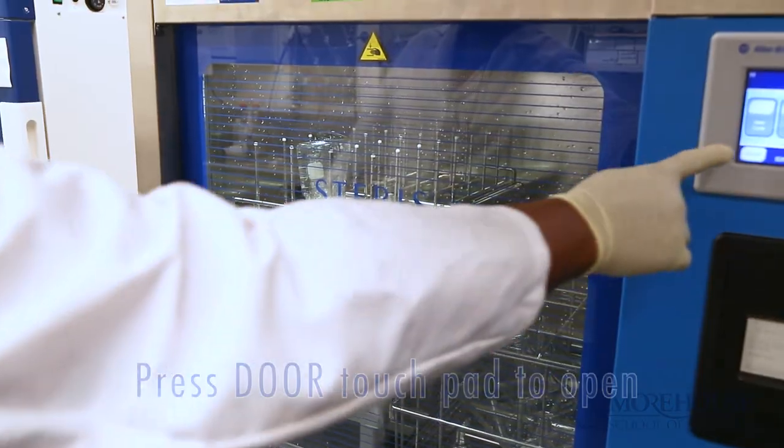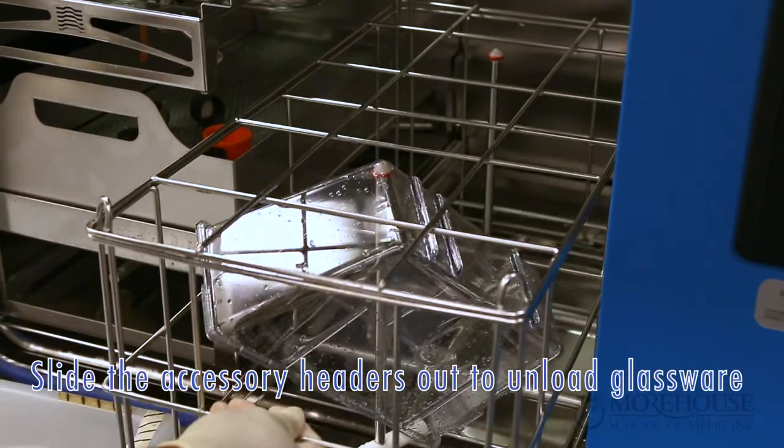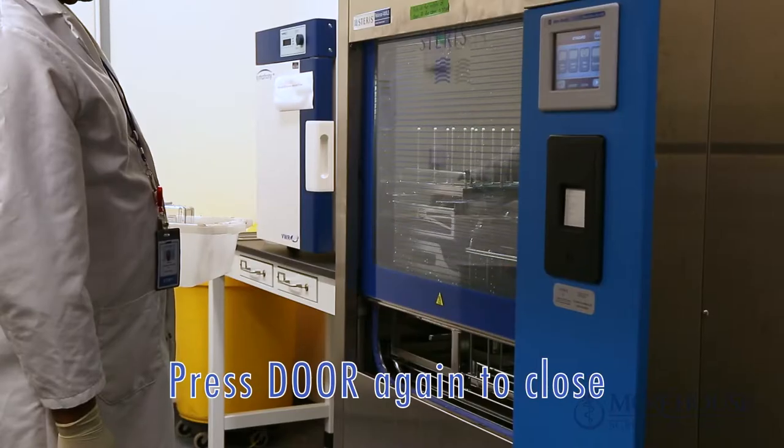Once the cycle is complete, press the door touchpad to open and slide the accessory headers out to unload your glassware. Press door again to close the door.